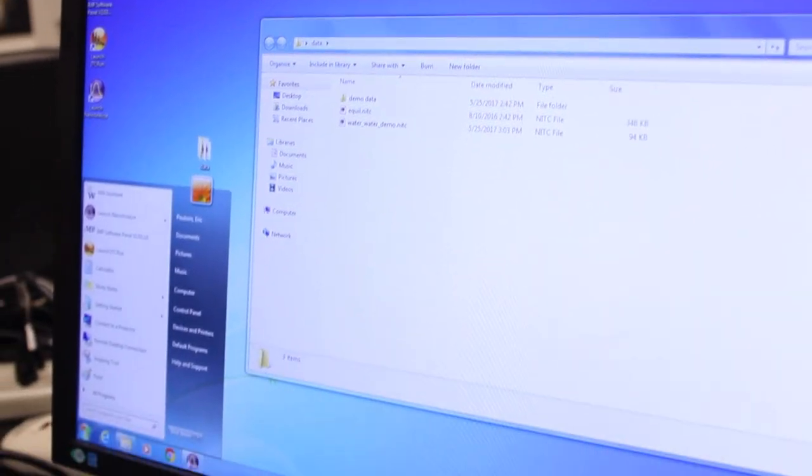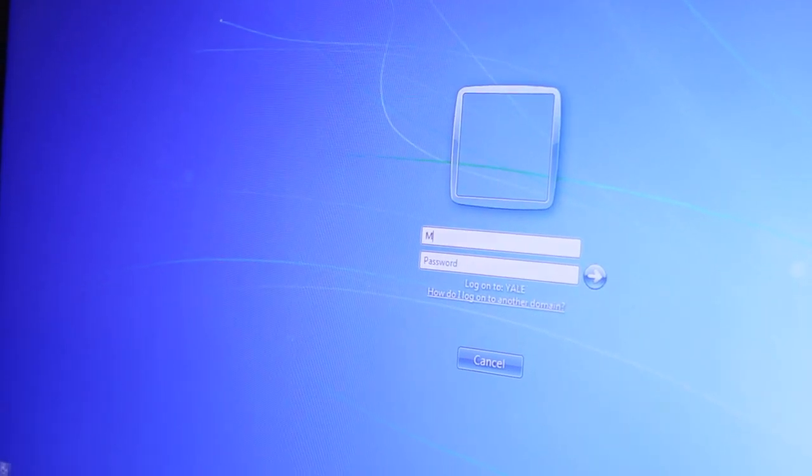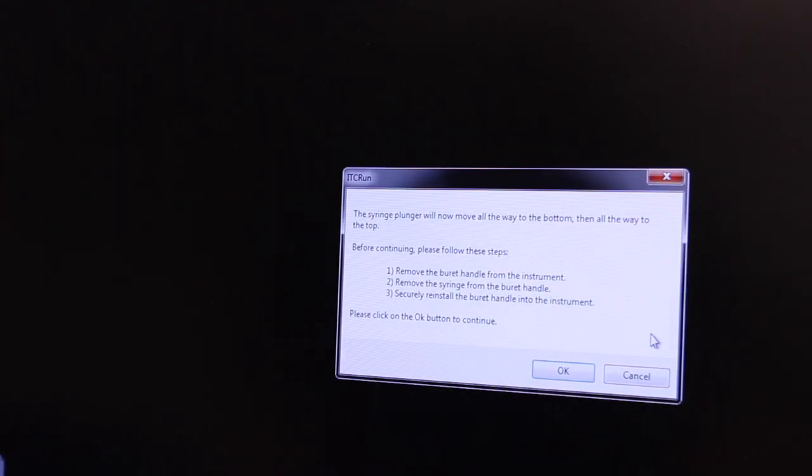Then you will want to exit the ITC run program, log out of your account, log on with the username and password shown in front of the instrument, restart the ITC run program and leave it running.